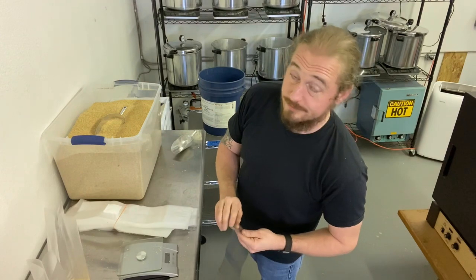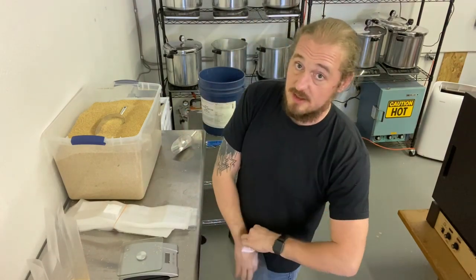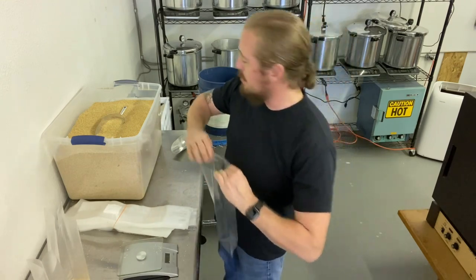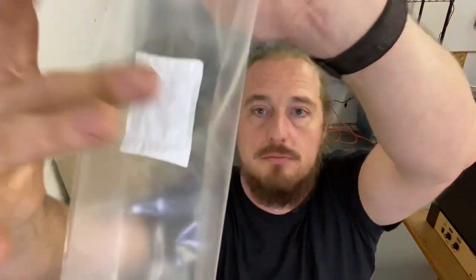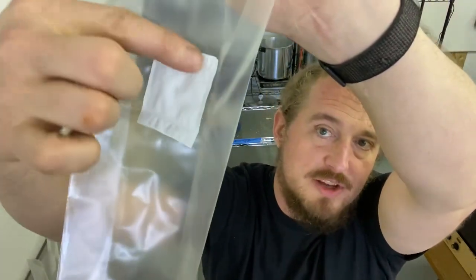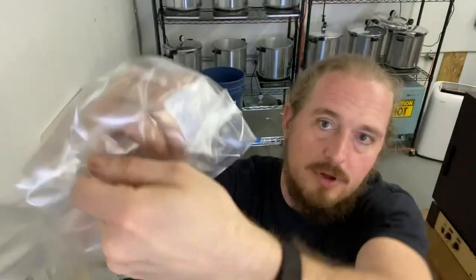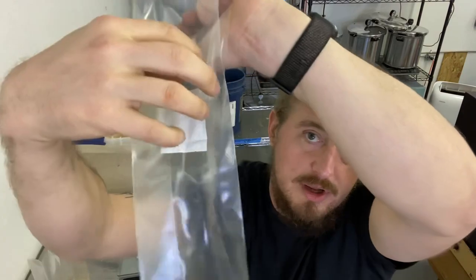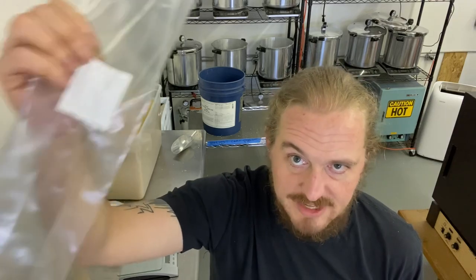Bag folding: do not fold the filter patches to the inside of the bag - we have learned this the hard way a couple of times. If you fold the filter patch into the interior of the bag, sometimes when it gets super-heated it will get loose and stick. So when you try to fill the bag back up after the cook, it tears the patch away, and you may not notice, leading to contamination issues.